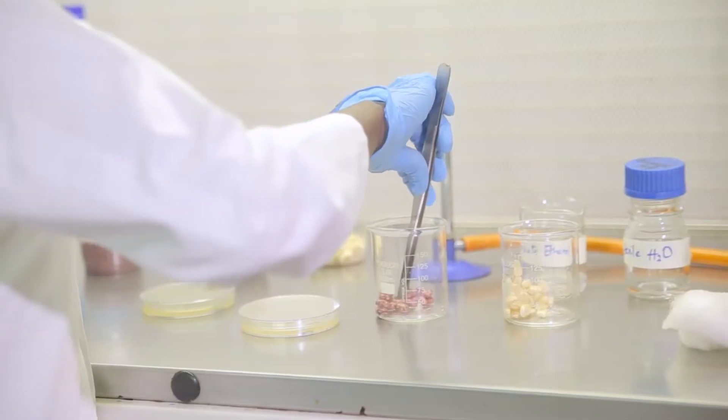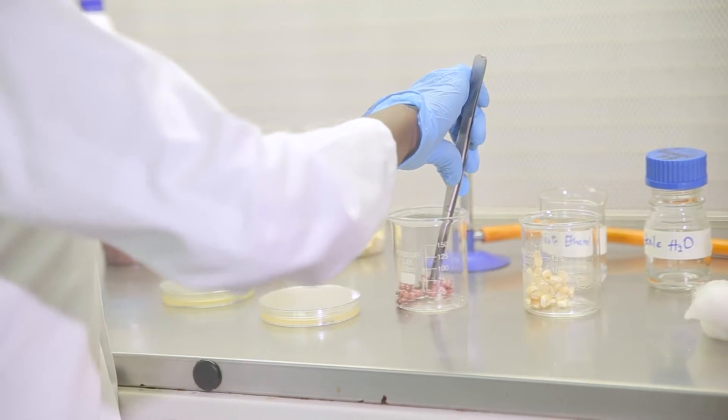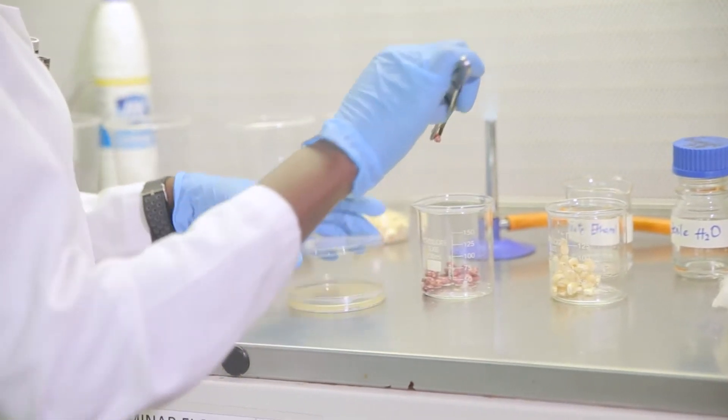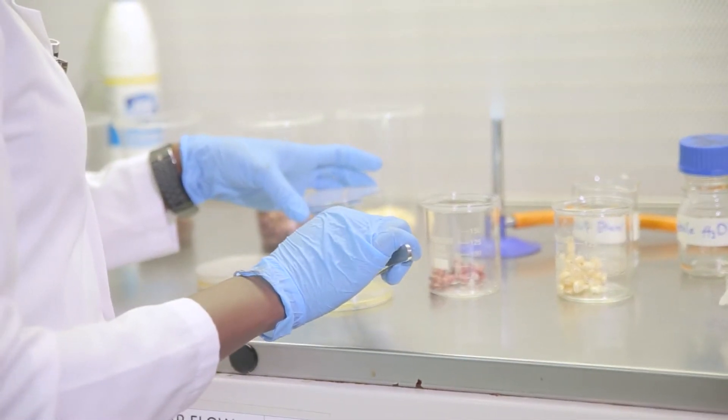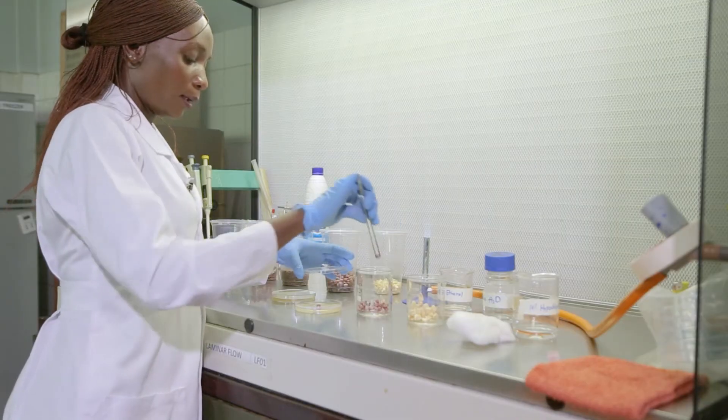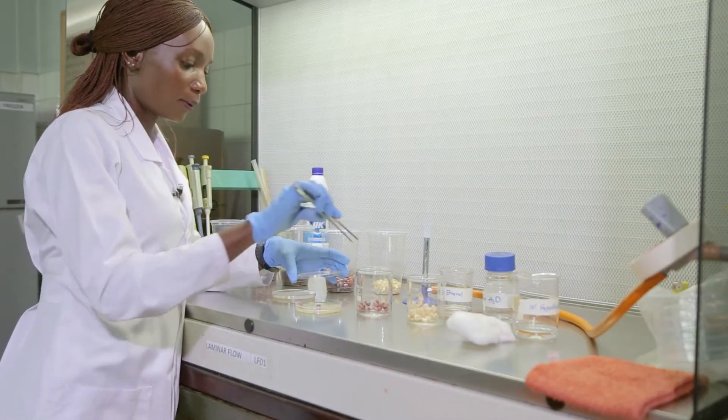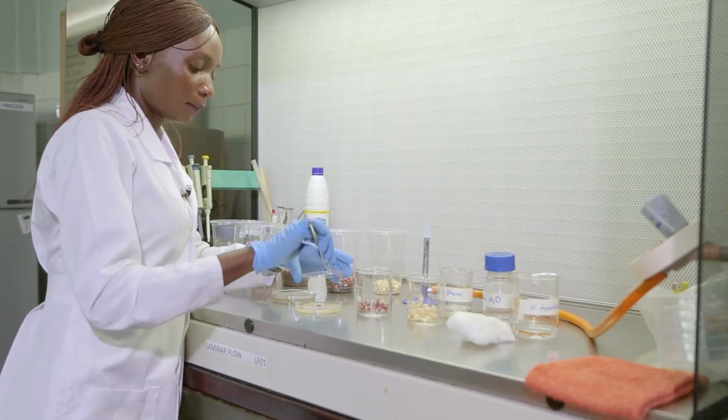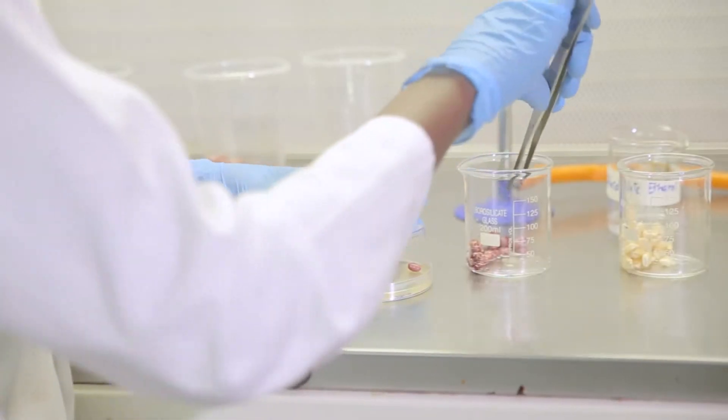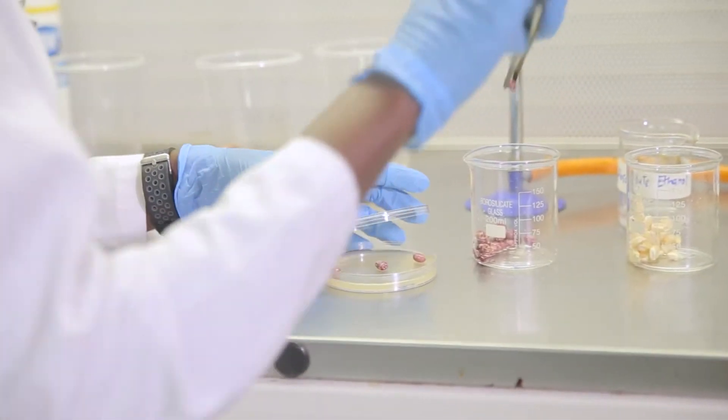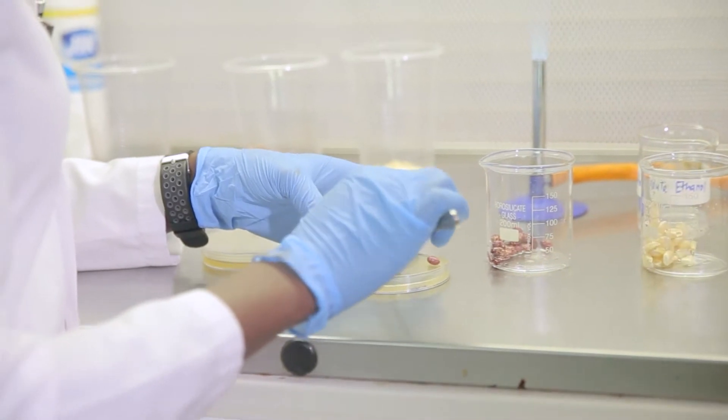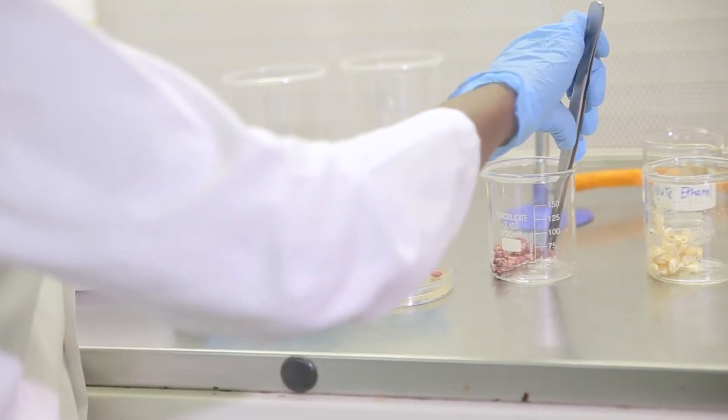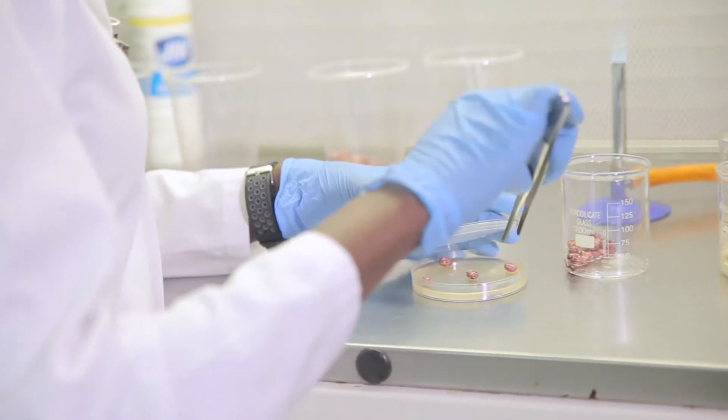So we are going to put our seeds on the surface of the agar. I'm going to put five seeds. I'll put one in the center and then I put the rest on the side. As you notice, I don't want to expose my plate too much.